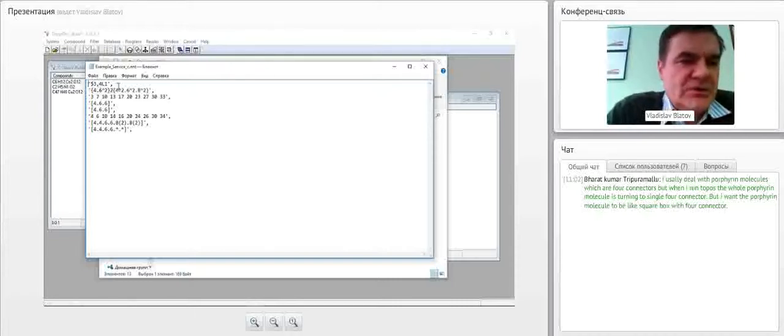first we need to be sure that this is really new. If it is new, really new, you should address to us and ask to input this topology into the TPD collection. This is another story, and in the Topos manual there is a special appendix where it is described how to apply for the name for the new topology. But now let's use this file to check if the topology is really new.